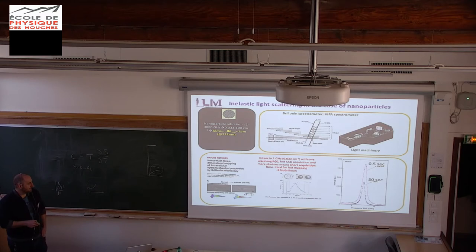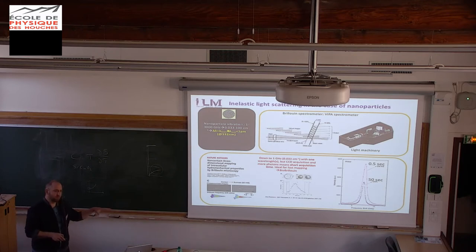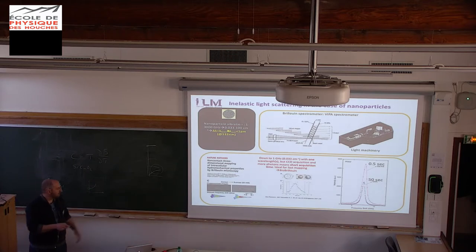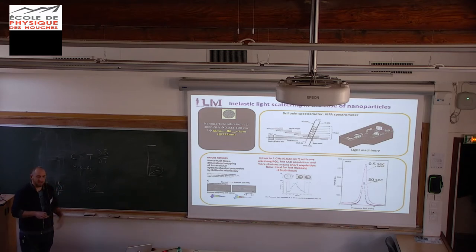You speak a little bit about it at the end of the talk, but these are examples from Giuliano Scarcelli, who images cells. So this is a cell, and he maps mechanical properties of the cell using Brillouin, and he looks at the effect of different parameters. So he puts sucrose here, and he sees that the stress increases inside the cell. He also made another experiment. This is an eye, I think. So he's scanning through the eye, and he's making the Brillouin spectra.